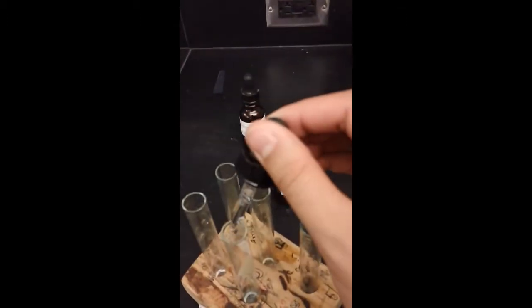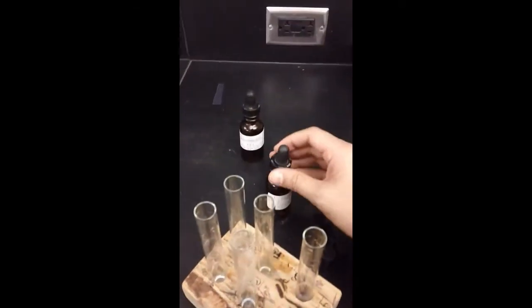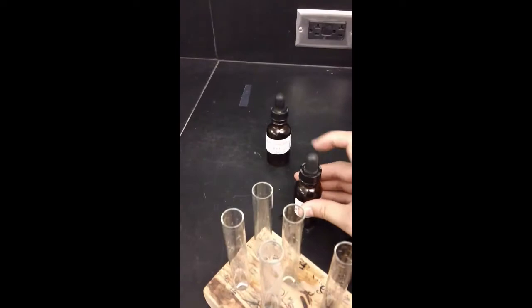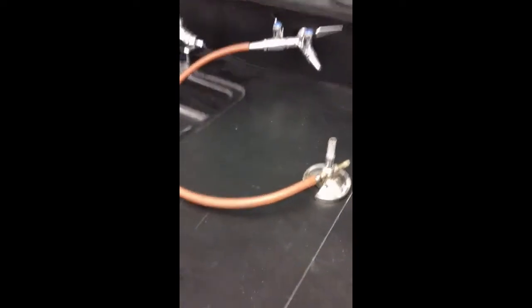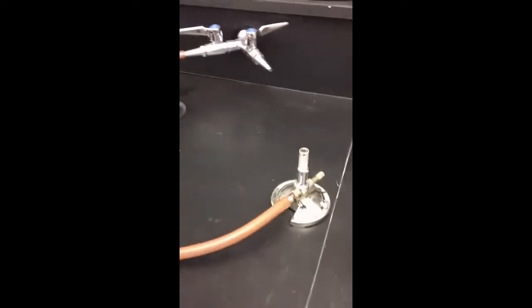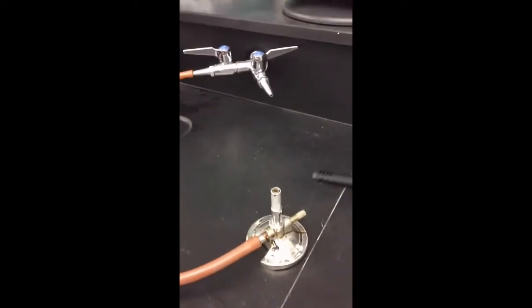So again, 1, 2, for each tube. What that does is it allows the reaction to be a little bit more dramatic for you to see. Okay, now I'm going to need to light my Bunsen burner. So here I need to make sure that my gas is turned on. Can you hear it? Okay, then I'm going to take my lighter.